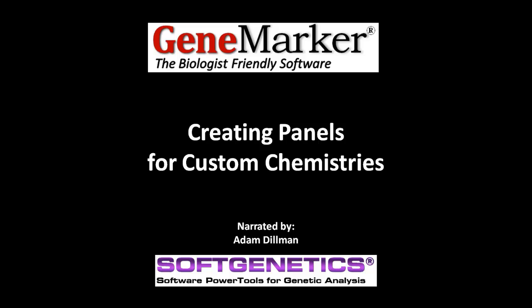Hello, my name is Adam Dillman. In this webinar, we will cover making custom panels, particularly for microsatellite and SSR analysis, AFLP analysis, and all other custom chemistries.